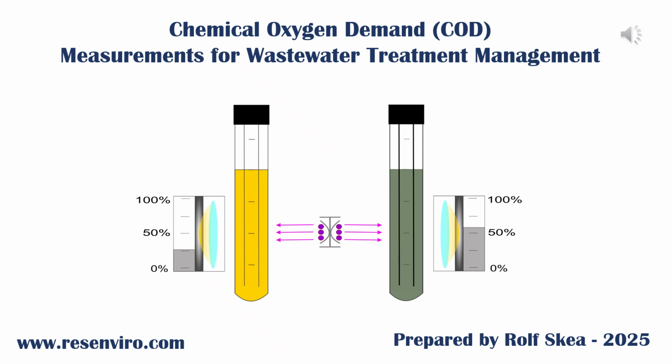In this section we are going to look at chemical oxygen demand measurements, how to do them, what we are measuring, and what we may use the data for.